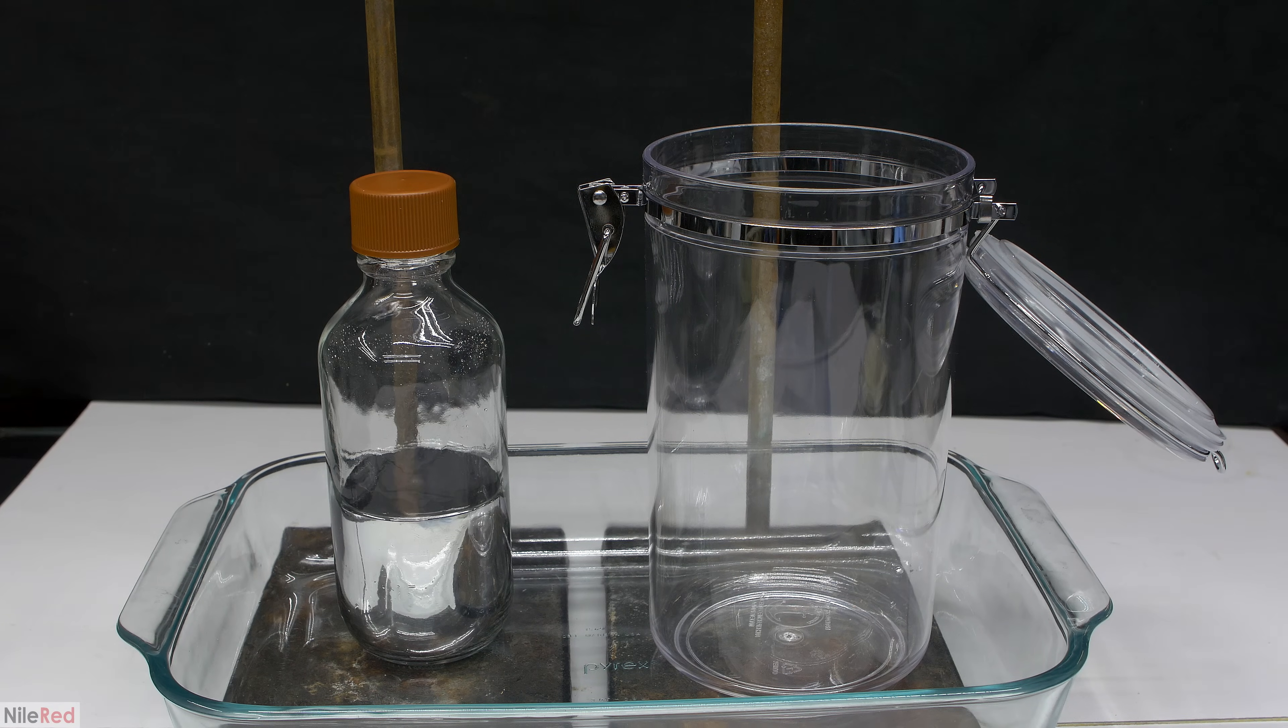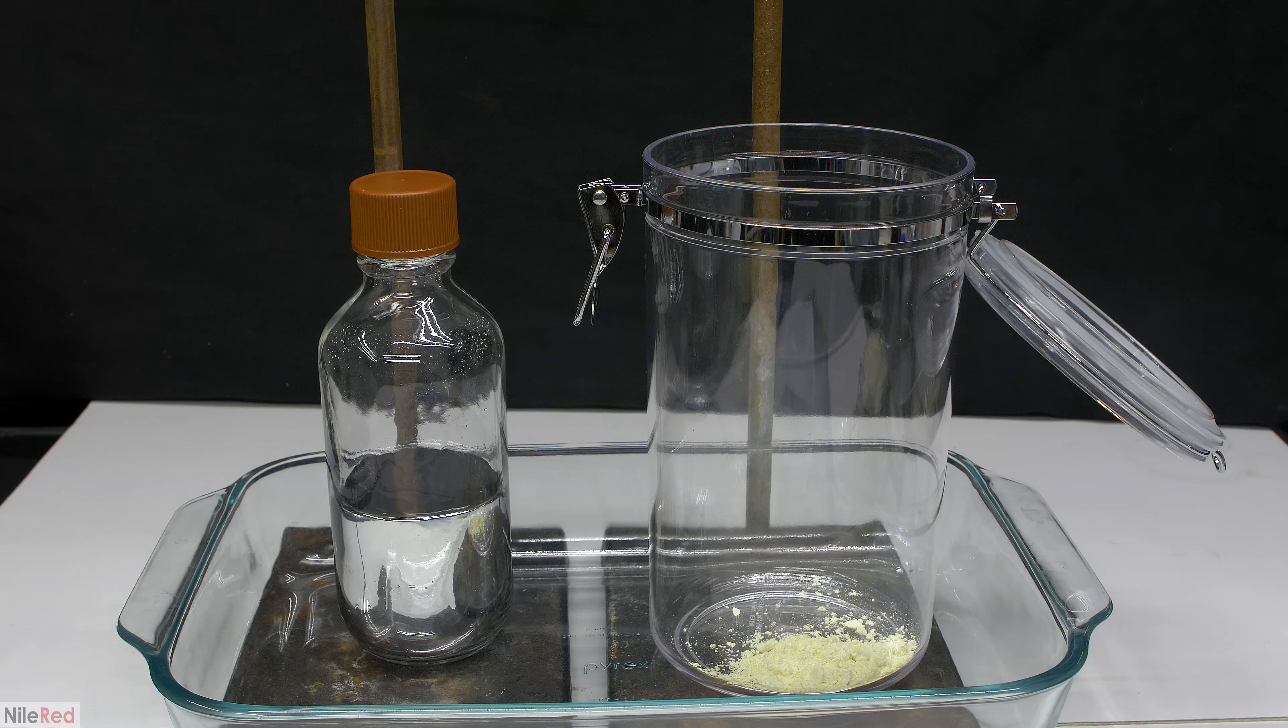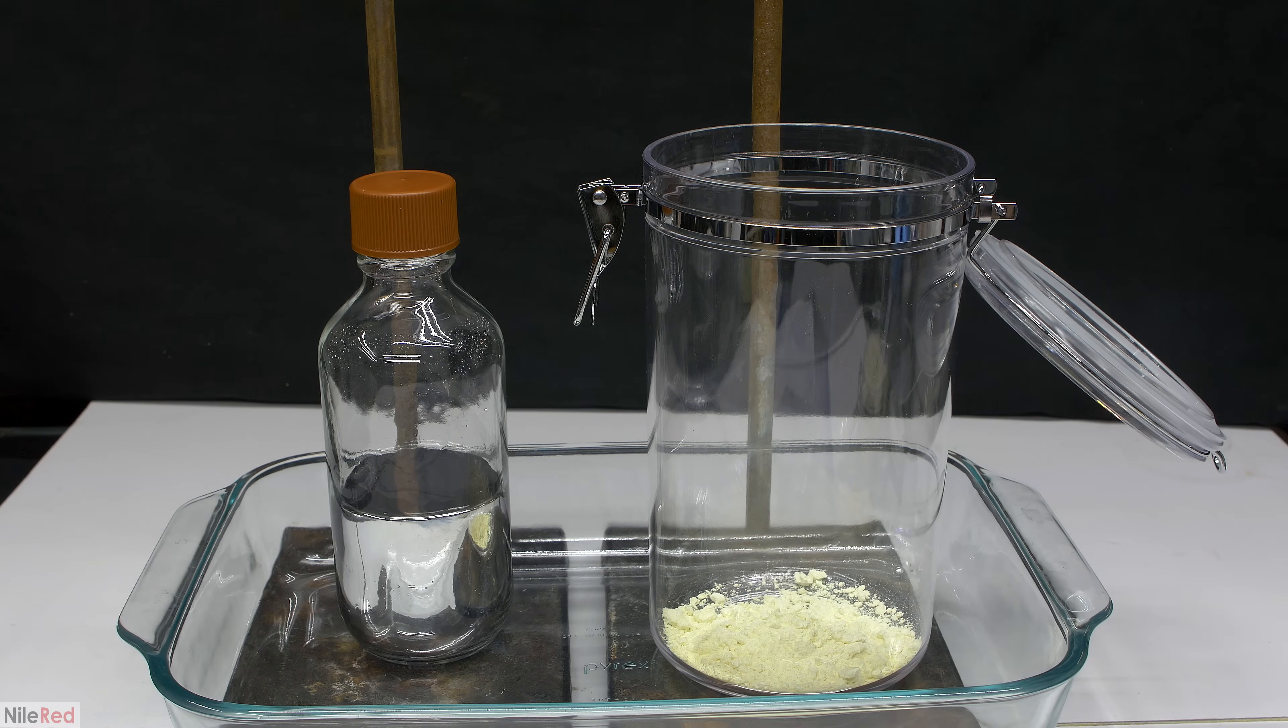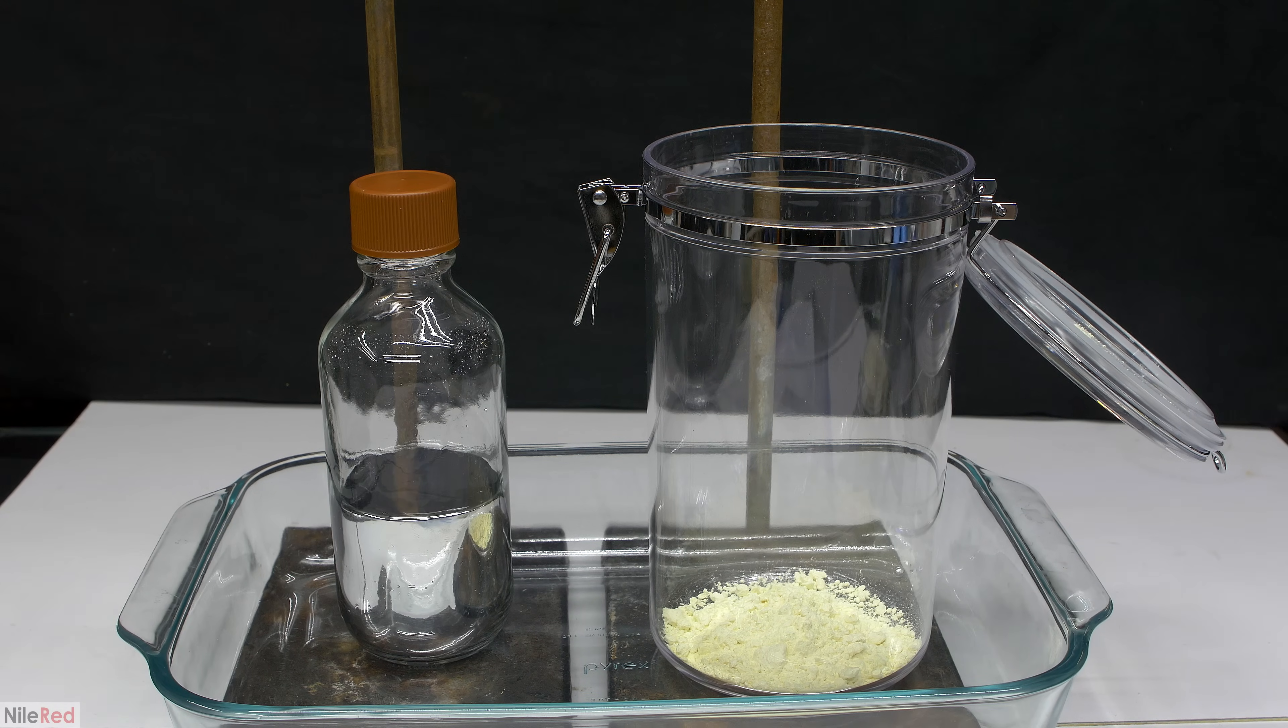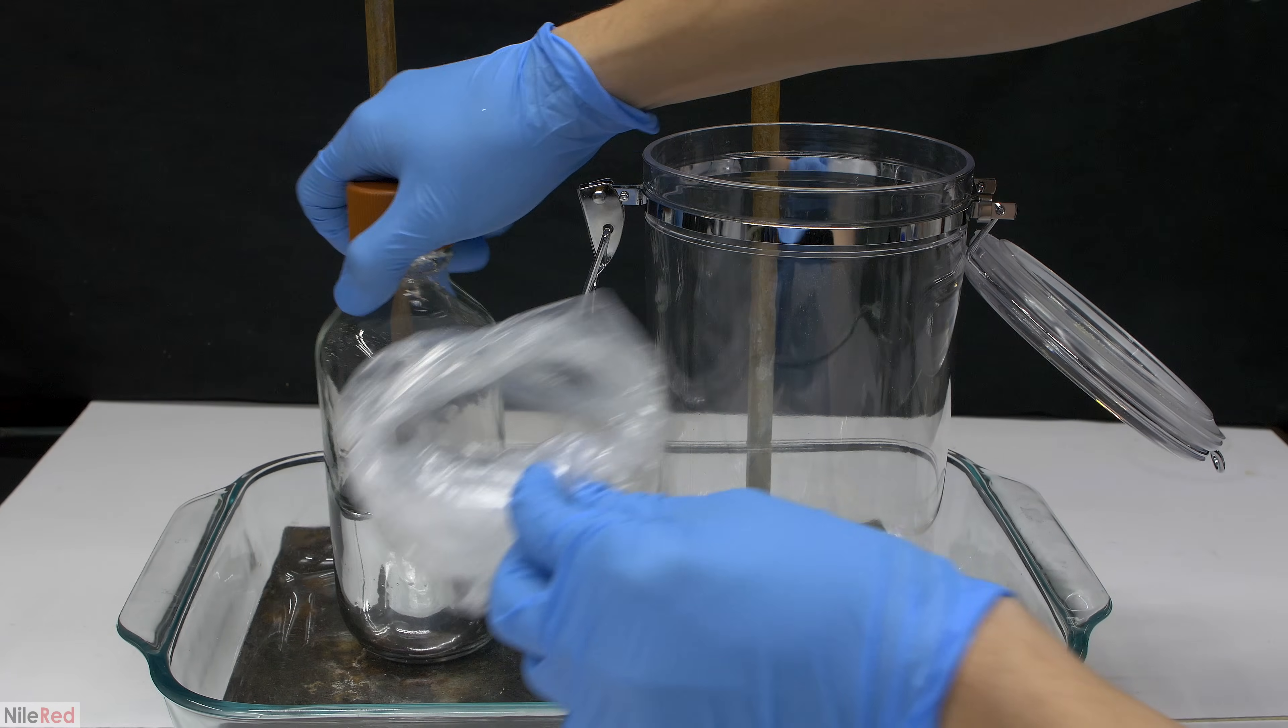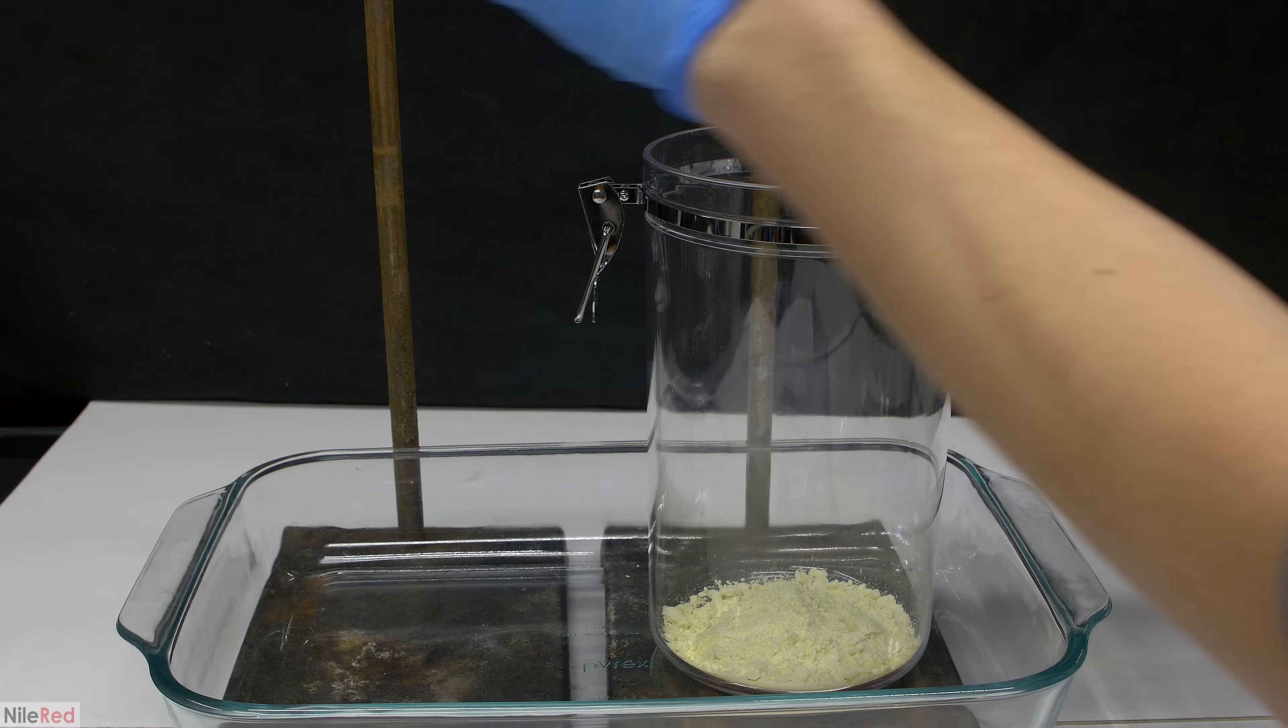Before I put the mercury bottle in, I dump in some sulfur. The reaction between mercury and sulfur is extremely slow at room temperature, but it's still useful to add. For short-term storage it would make no sense, but for long-term storage, if any mercury vapor were to escape the bottle, it would have enough time to react with the sulfur.